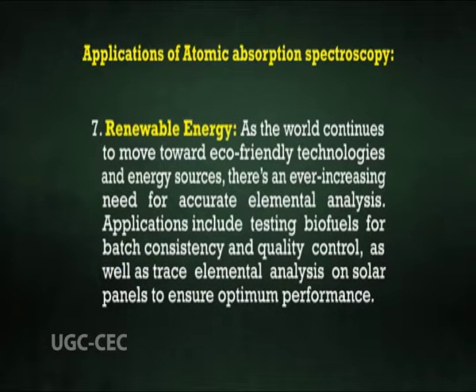Number 7, renewable energy. As the world continues to move towards eco-friendly technologies and energy resources, there's an ever-increasing need for accurate elemental analysis. Applications include testing biofuels for batch consistency and quality control, as well as trace elemental analysis on solar panels to ensure optimum performance.